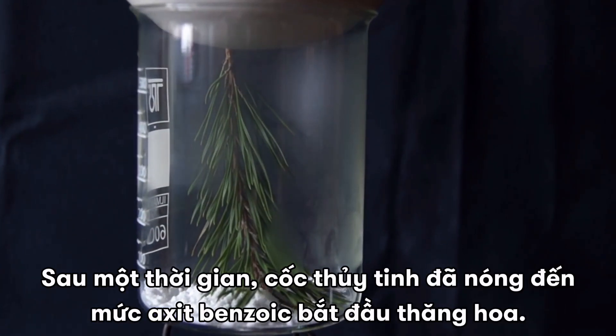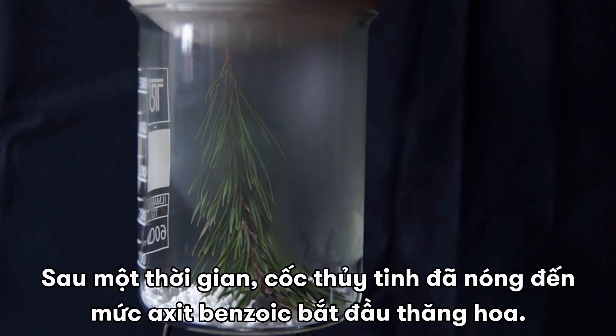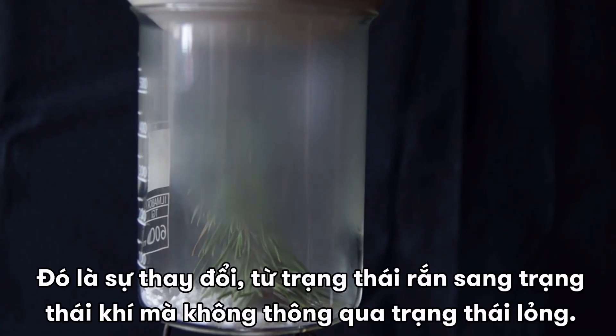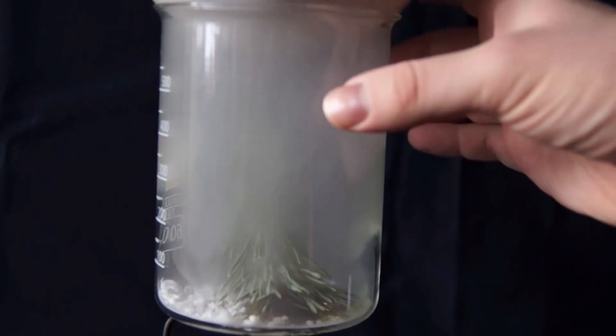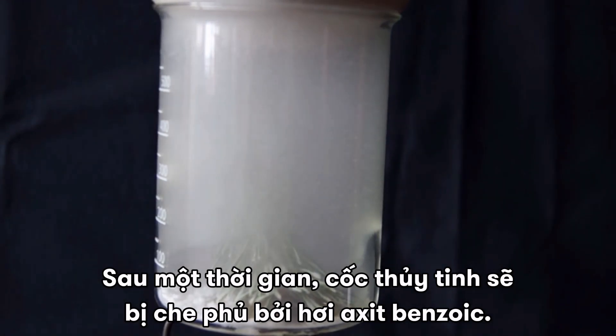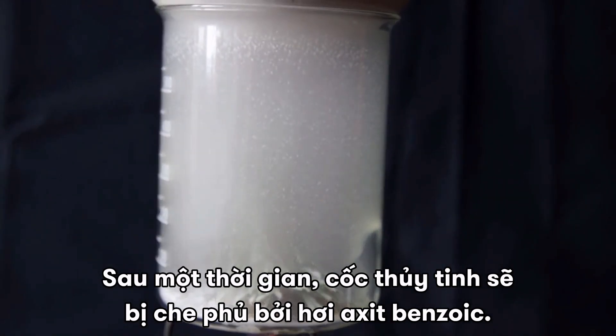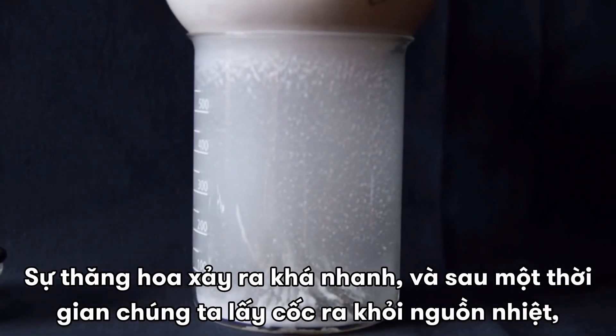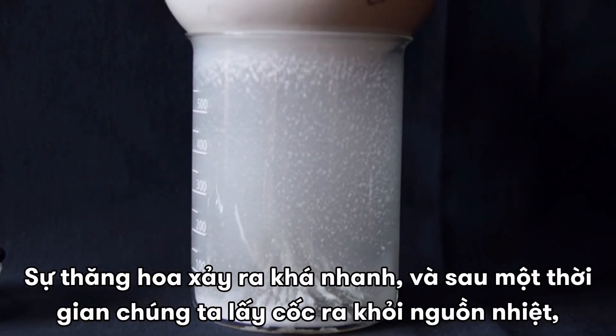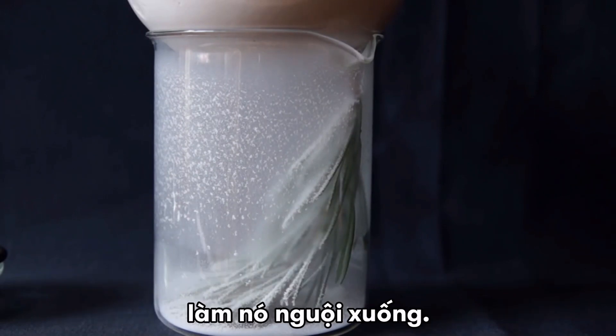After some time the glass is heated to the level that the benzoic acid begins to sublimate. This is the change from solid to gaseous state without going through the liquid phase. After some time, the glass is going to get filled with fumes of benzoic acid. Sublimation occurs fairly quickly, and after a while, we take the glass away from the heat to cool it down.